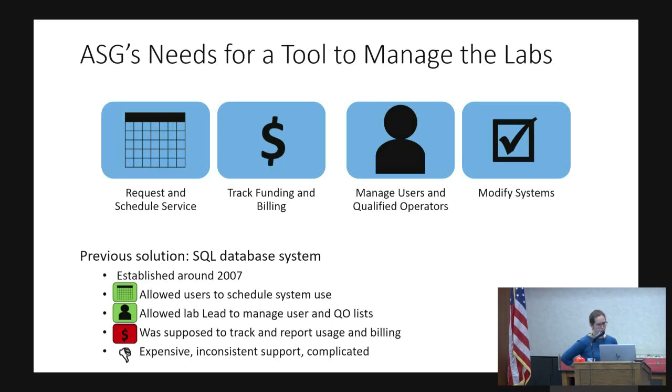So we had been using this SQL database system, and it was established around 2007. It was really nice, it allowed users to schedule equipment, and it also allowed the lab lead to manage that user list and qualified operators list, and that is kind of where the compliments for the system stop.